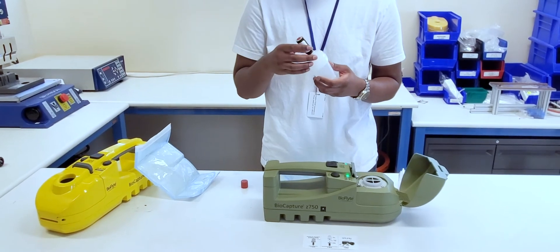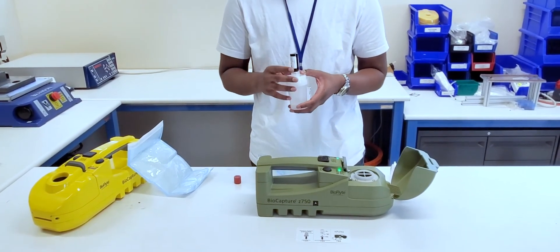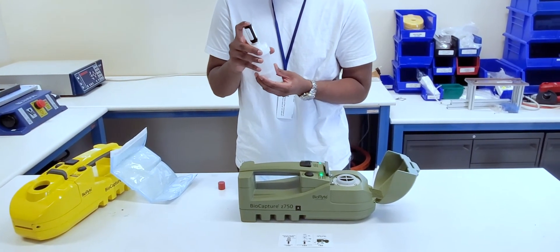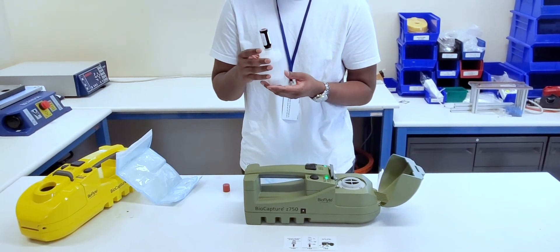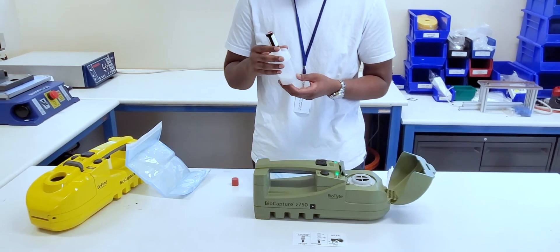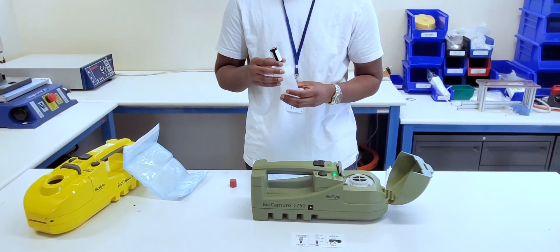After that, we can put our adapter on top of our filter, and we're ready for Step 3. For Step 3, we simply press down on the elution canister, and it will remove the sample from the filter and put it into the vial. We will have up to 5 to 6 milliliters of sample that is ready to test after just 30 seconds.